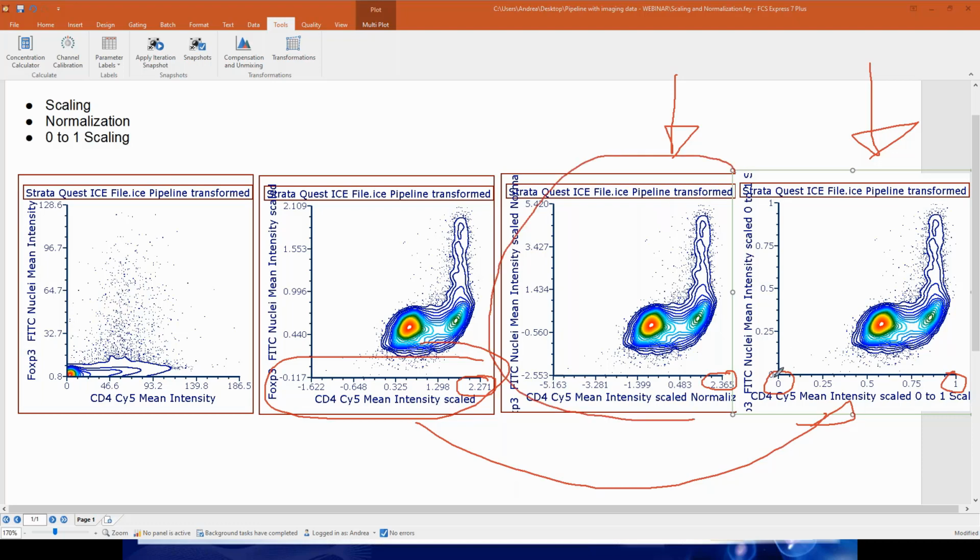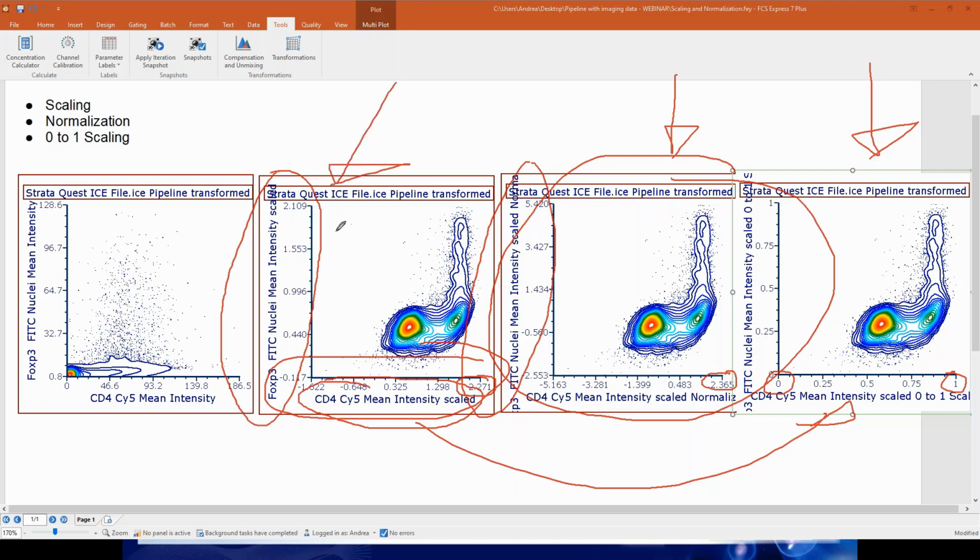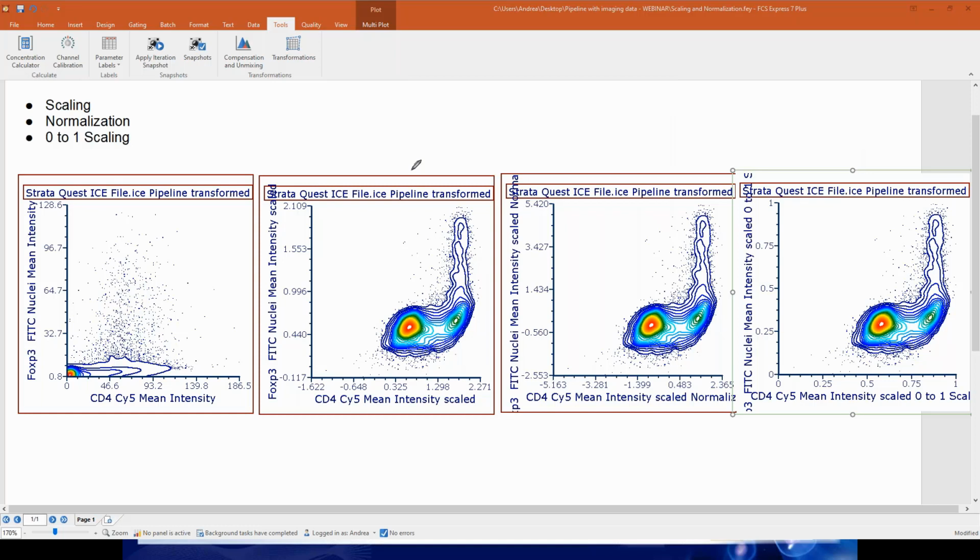So, for example, in this case, we divided all the CD4 values by the CD4 standard deviation, and then we subtracted the CD4 mean. And for the FITC, we took all the scale values, we divided by the standard deviation of the scale values, and we subtracted the mean of the scale values. So it's within parameters. But that's a great question actually, and we are working to allow a new normalization step to normalize based on a reference. That's super interesting to do.